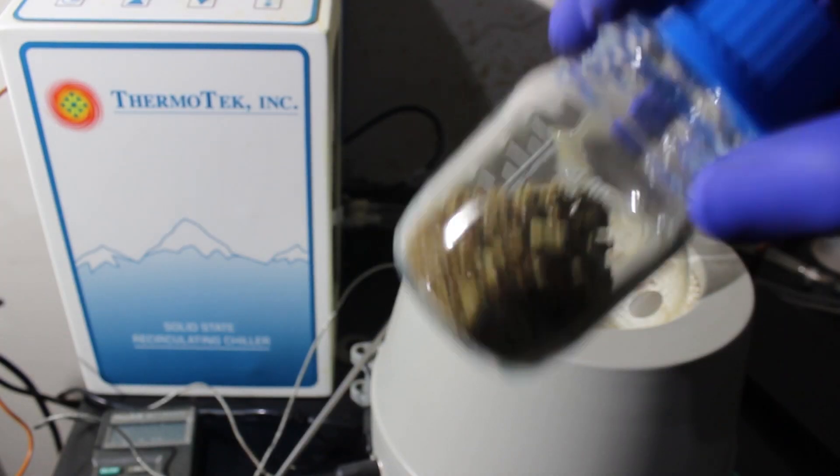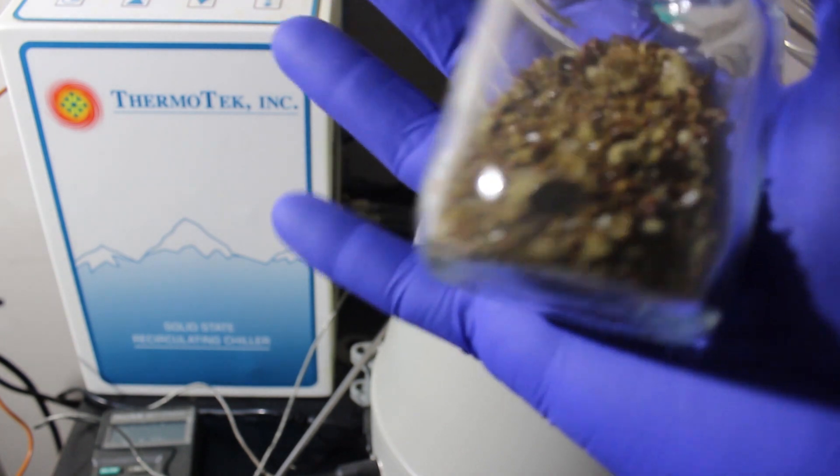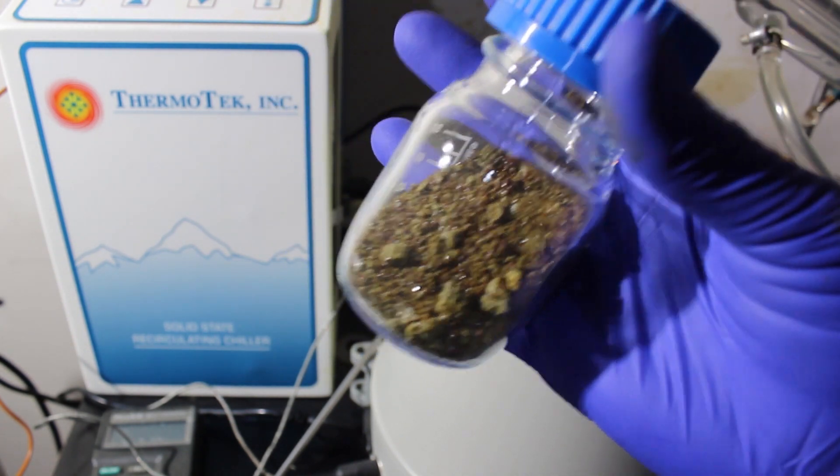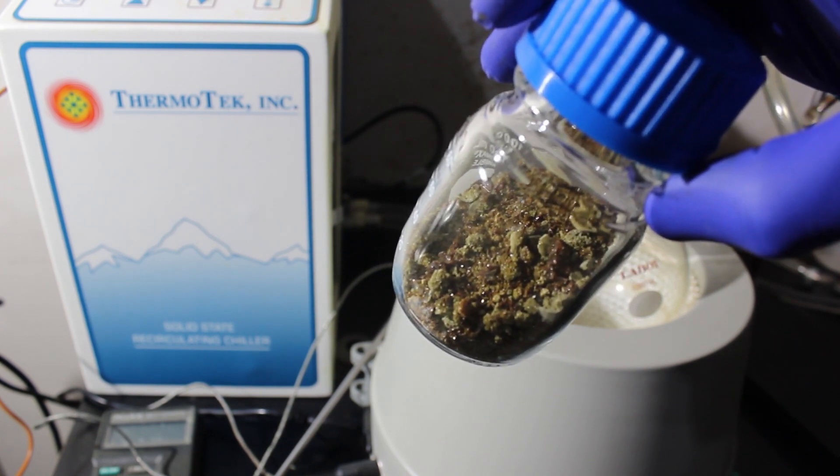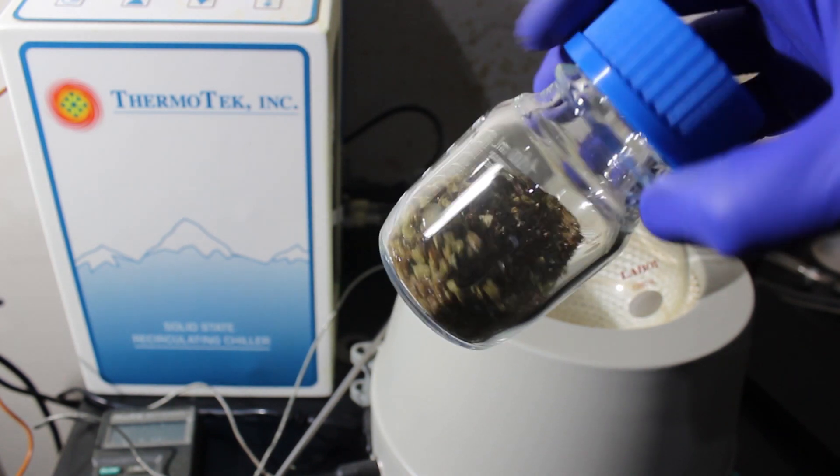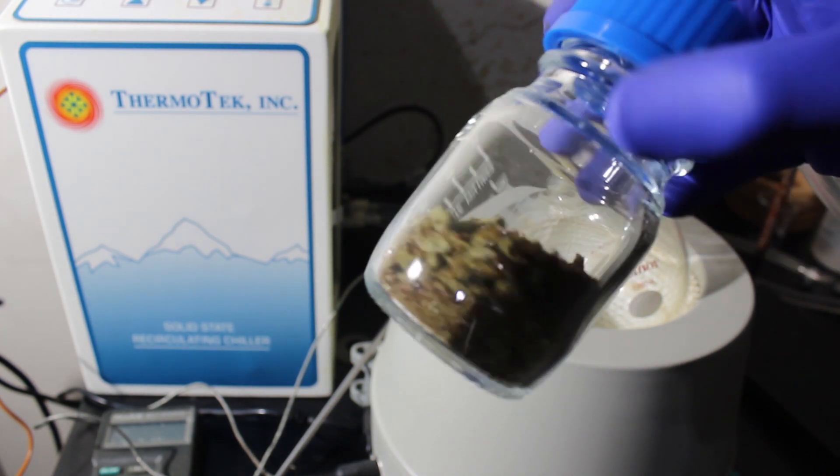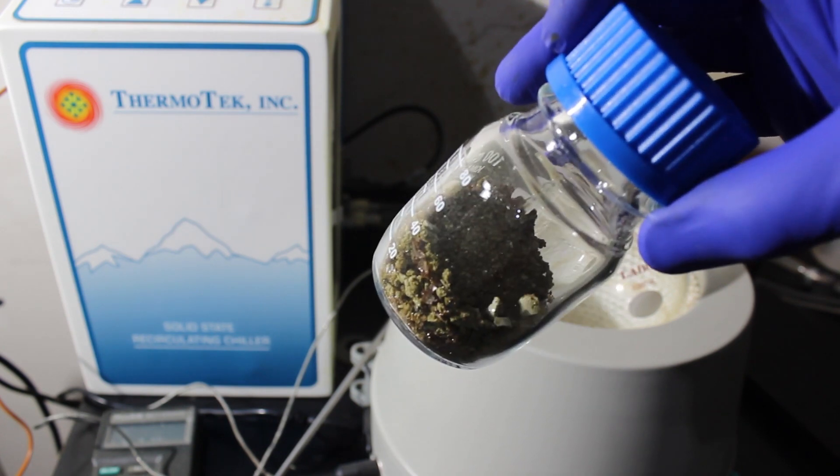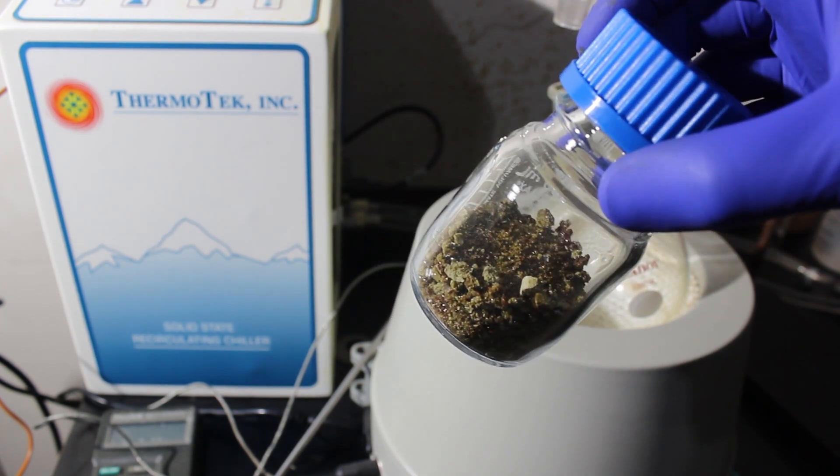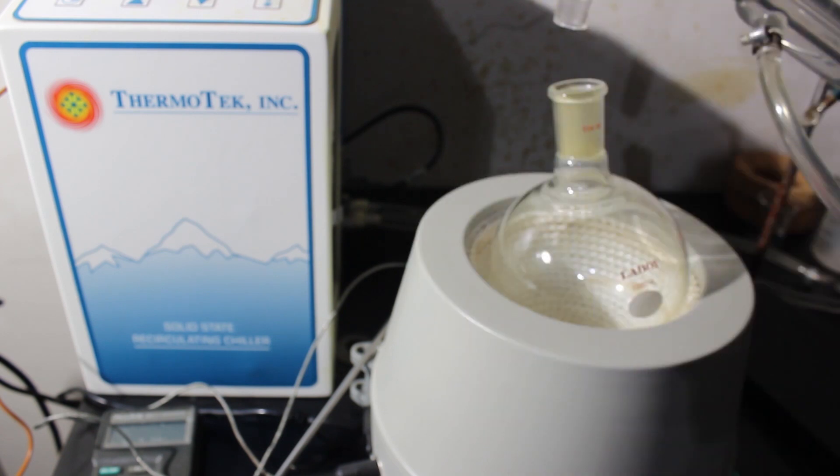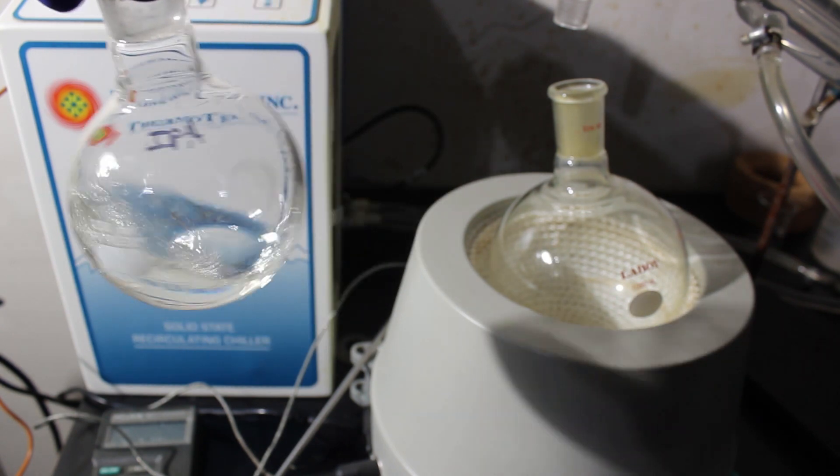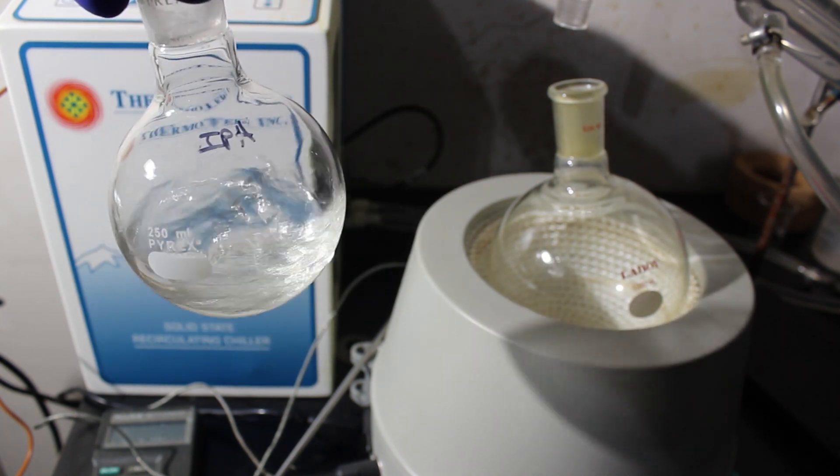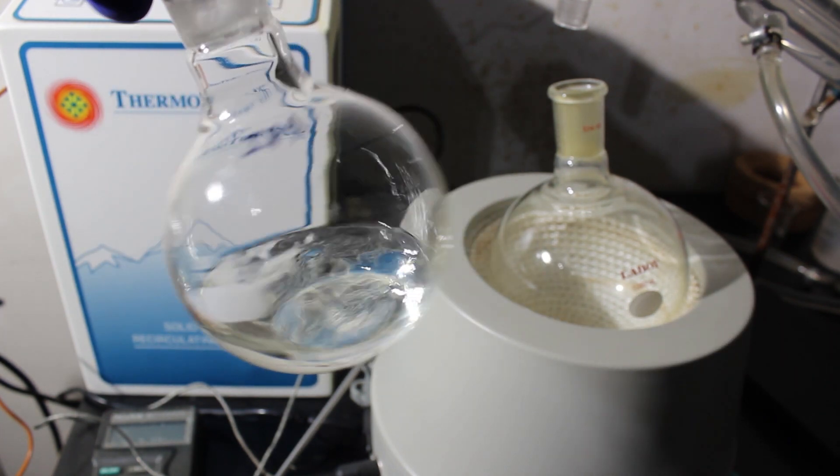After doing the distillation I was left with this solid down at the bottom of the flask. I've crushed it up and powderized it. It's kind of this weird brown-green color. I'll keep this, analyze it, and we'll see what it is. I also have my distillate here and we'll take that and see if we actually made some methyl iodide.